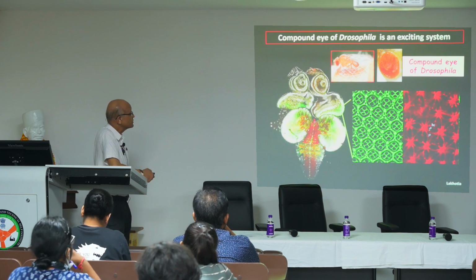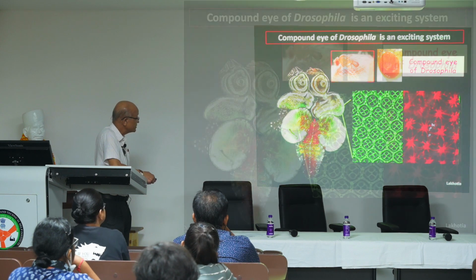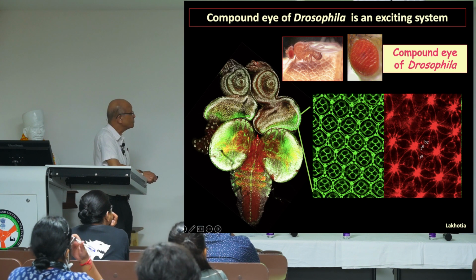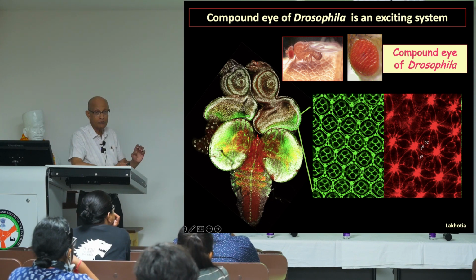This is another example, Drosophila. This part is the brain, the larval brain hemisphere. This is the equivalent of our ventral nerve cord, and this is the developing eye. This will be the developing antenna, and one can see more details: which tissue is forming how, which proteins are localized where. This is where the beauty of the confocal microscope is.